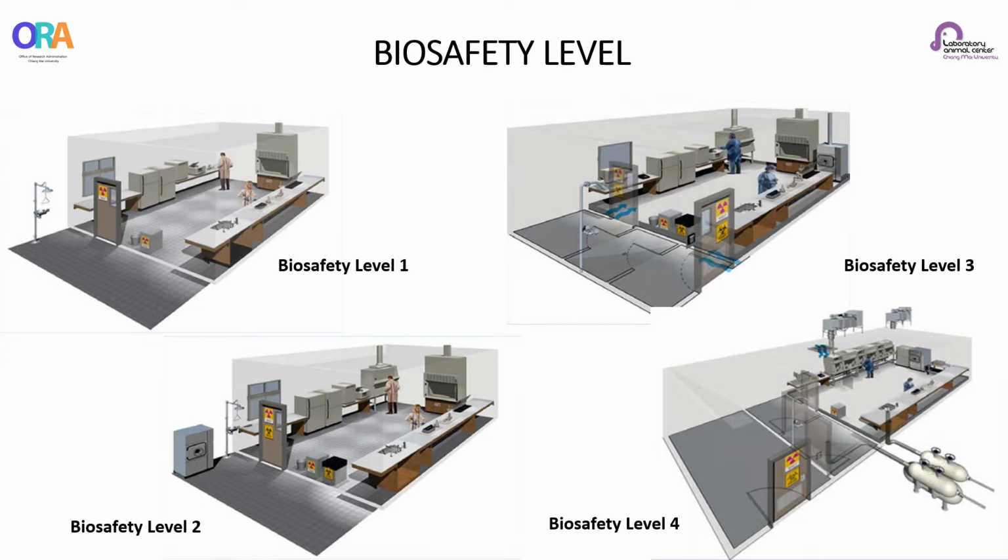The primary route of exposure to personnel working with these types of biological agents relates to accidental exposure via percutaneous and mucous membrane routes and inhalation of potentially infectious aerosols. The laboratory worker's complete isolation from aerosolized infectious material is accomplished primarily by working in a Class III BSC or a suit, and the secondary barriers for BSL-4 laboratories should include those previously mentioned for the previous levels of biosafety laboratories.